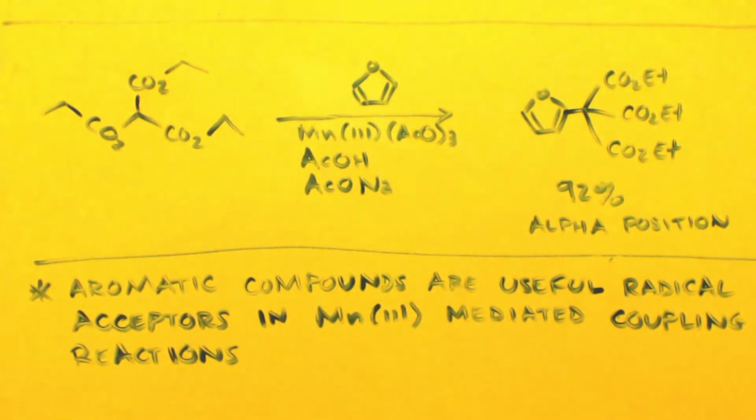You know what I mean? You would make it anhydrous. It's hard to get. And anhydrous acetic acid, you don't need it apparently because you can use the dihydrate. So I don't see the sense in making it that way. So this is a good thing. You can use the dihydrate. I just wanted to bring that up.